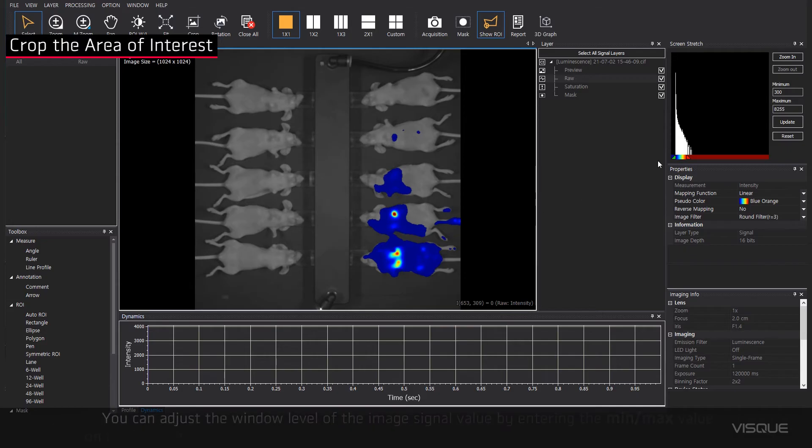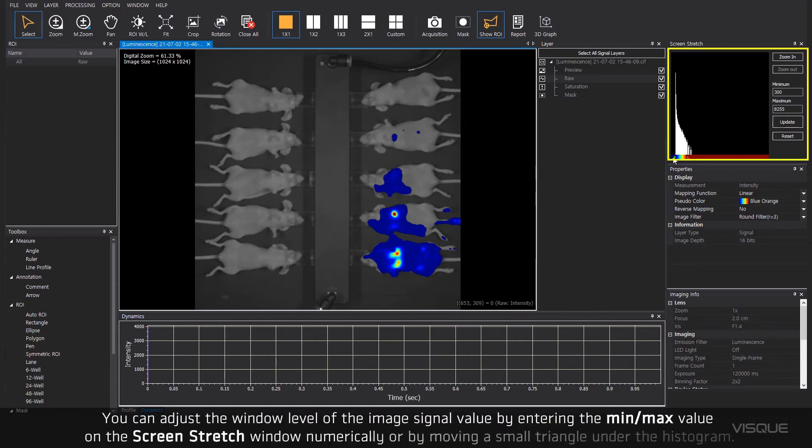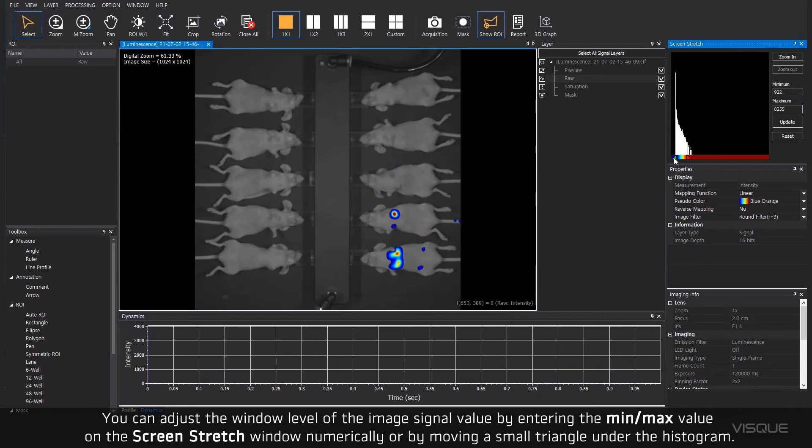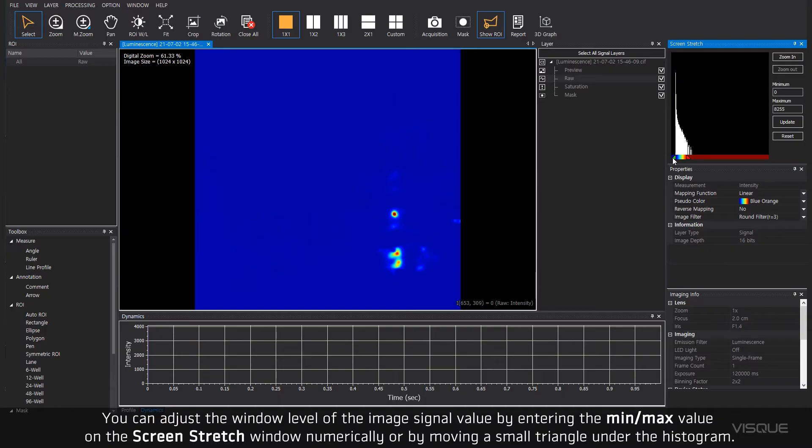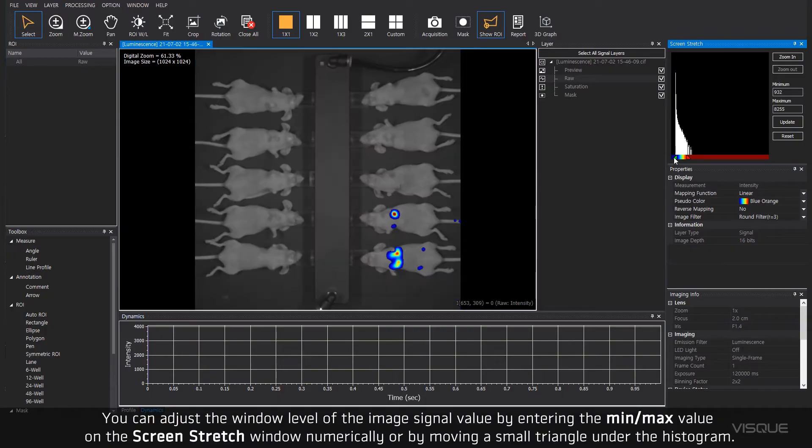You can adjust the window level of the image signal value by entering the minimum or maximum value on the screen stretch window or by moving a small triangle under the histogram.